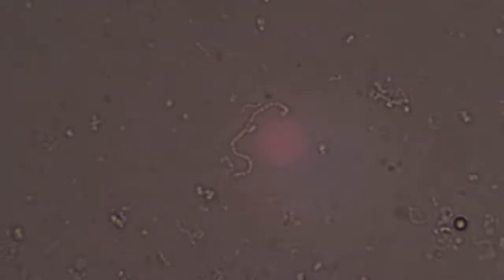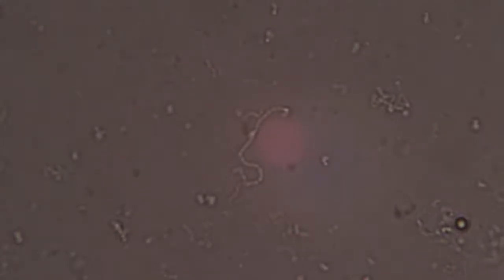And see, they're moving with Brownian motion. That's the heat from the lamp making the water molecules and such bump into them and make them do the little dance.